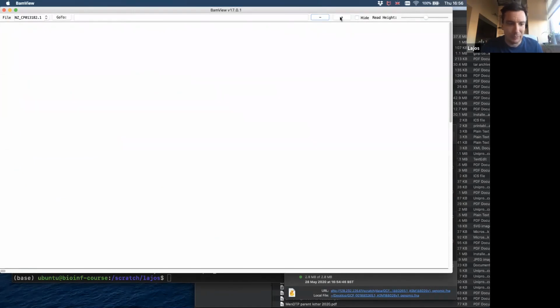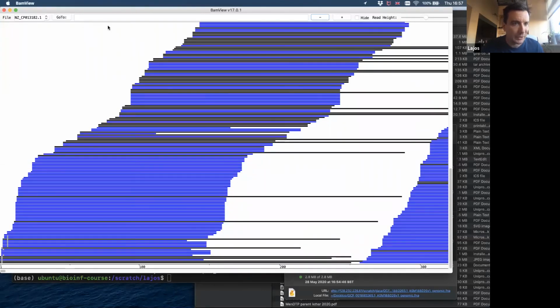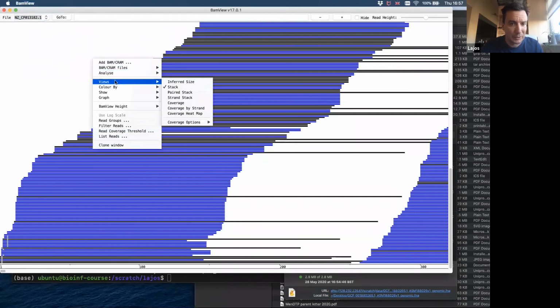But actually, yeah, it is here. I don't really see the reference sequence here yet. I am not sure about the reference sequence.